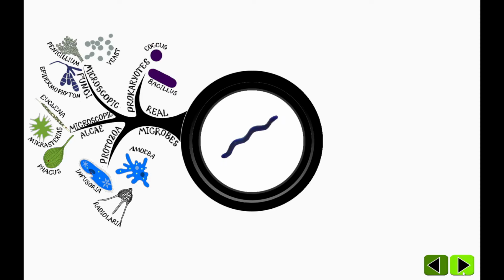Bacteria and archaebacteria are domains of unicellular organisms that lack a cell nucleus. They are usually very simple in shape, like spheres or rods. Bacteria and archaebacteria are much smaller than all other microorganisms, with an average size ranging from 0.5 to 5 micrometers.